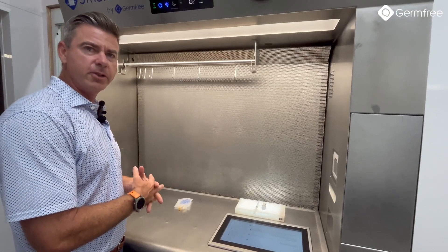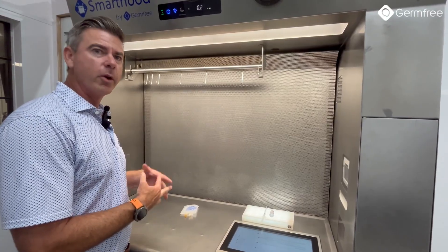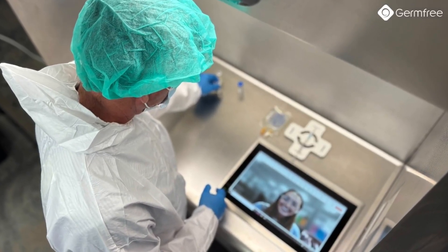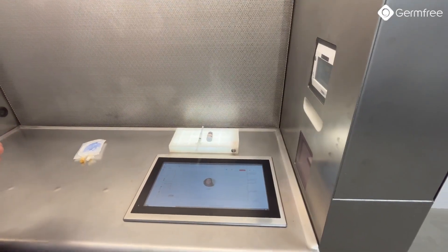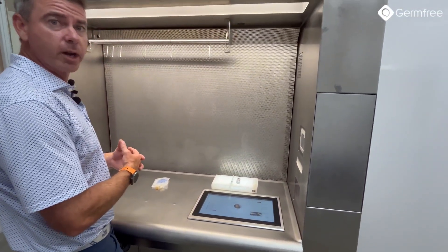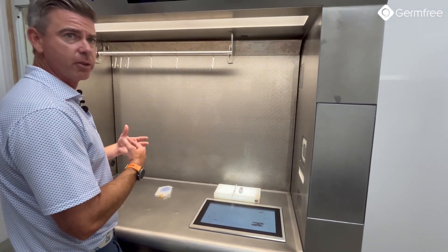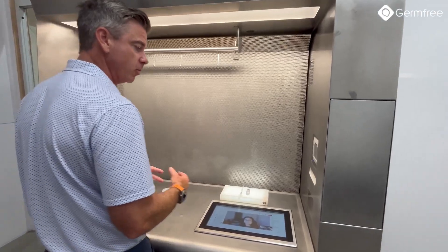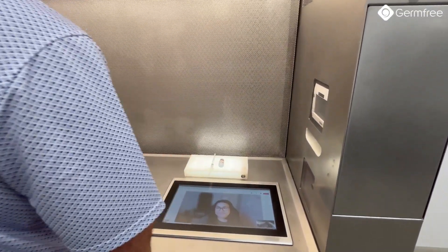One of the best features of the SmartHood is the integrated communication. We have the ability to take Microsoft Teams calls with anyone within the organization. With the click of one button, I can call anyone I want to — my pharmacist, other technicians, my directors, anyone who wants to see exactly what's going on within the SmartHood.